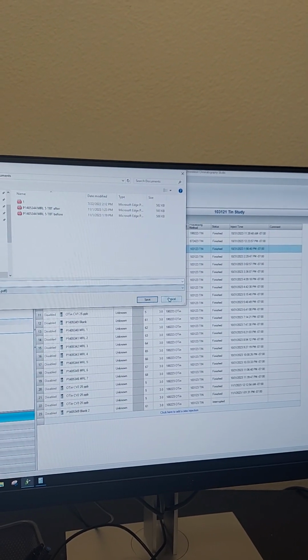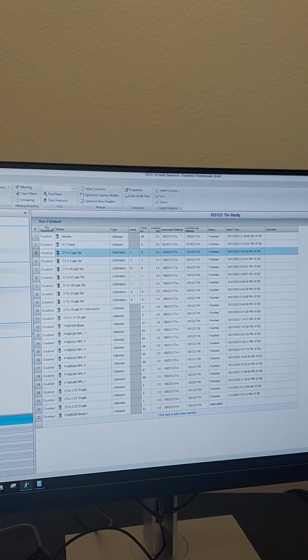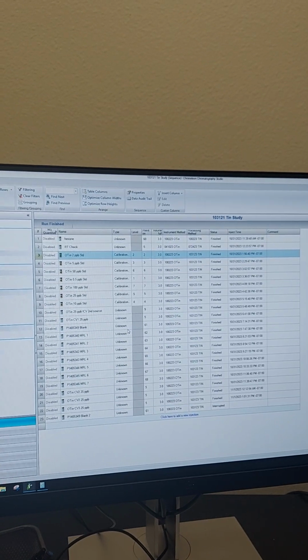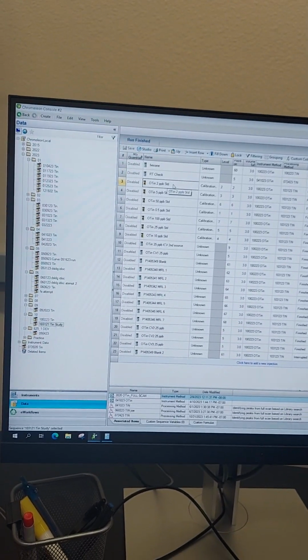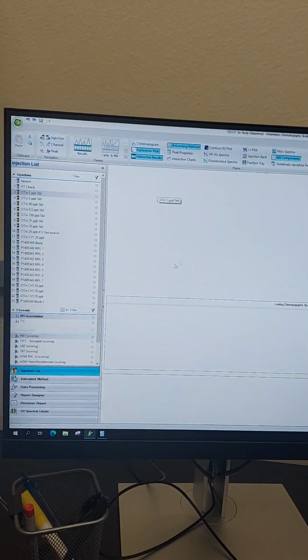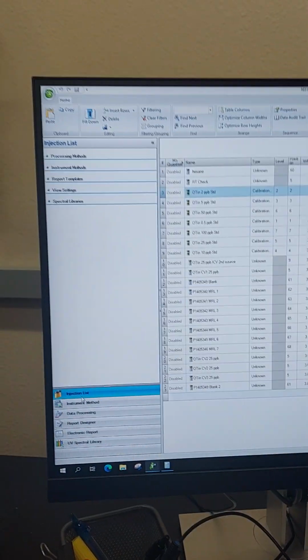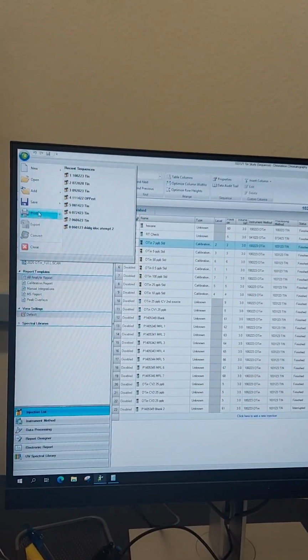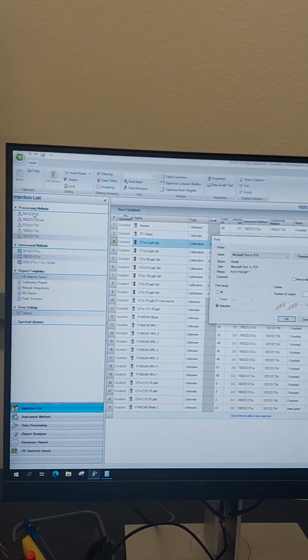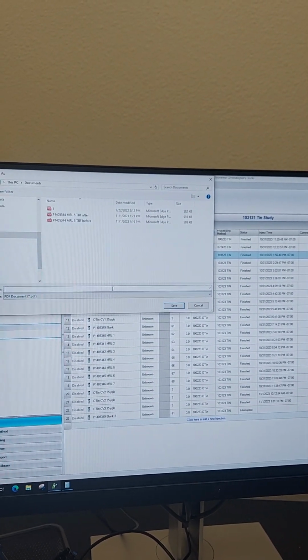Okay. So right now, what did I do? I don't know if this is how to do it. Let me see. From the regular Chromeleon console, I went into Chromeleon Studio, where you process the data. Then I went to injection list, and then here's where I will print, to see if it appears. Yeah, let's see if this works.